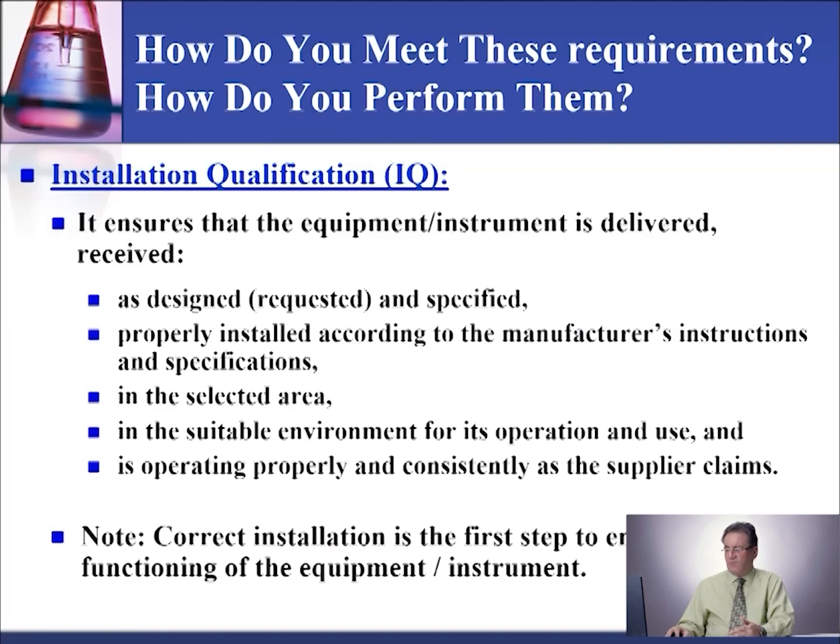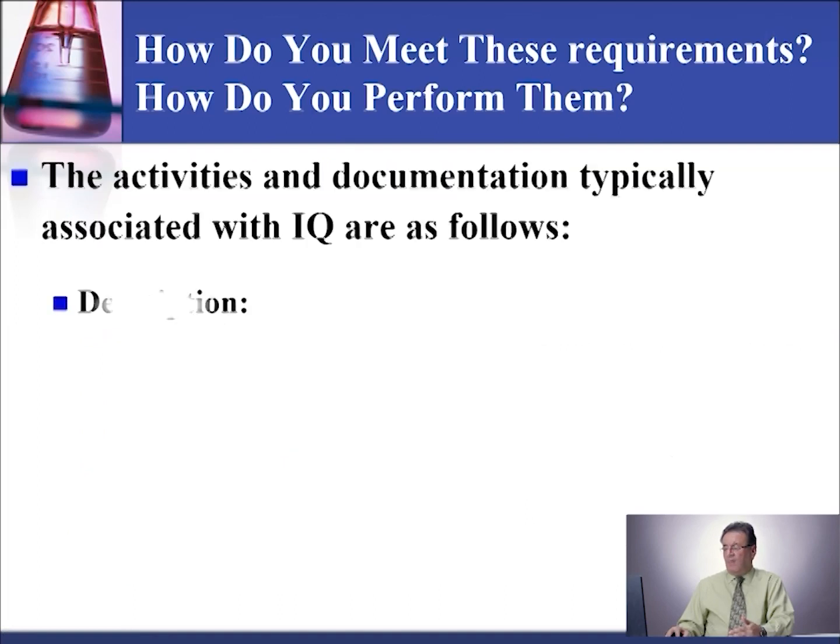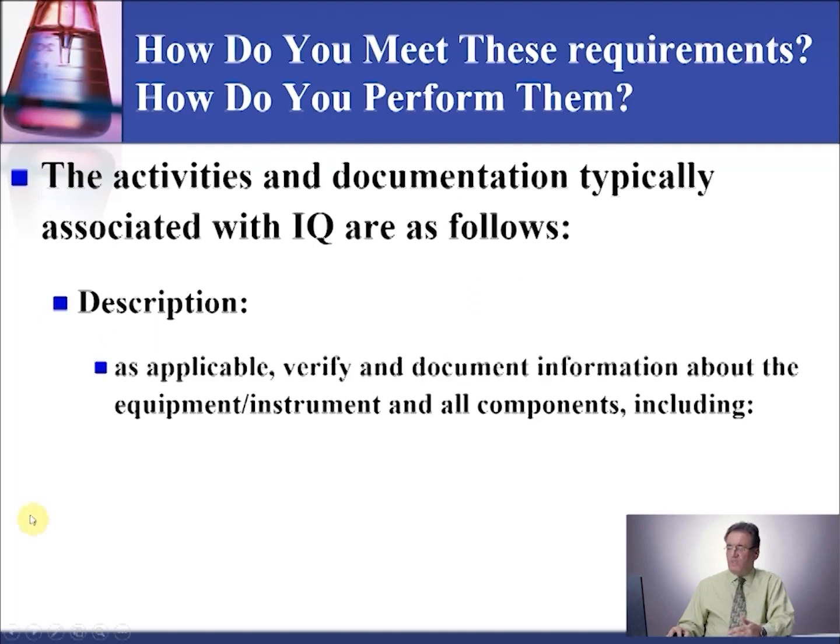Some notes regarding this item: the results of the qualification phases or stages need to be documented on the qualification forms, as I stated before, and the PQ needs to say very clearly if the equipment or instrument can be used for patient testing and resulting or not.